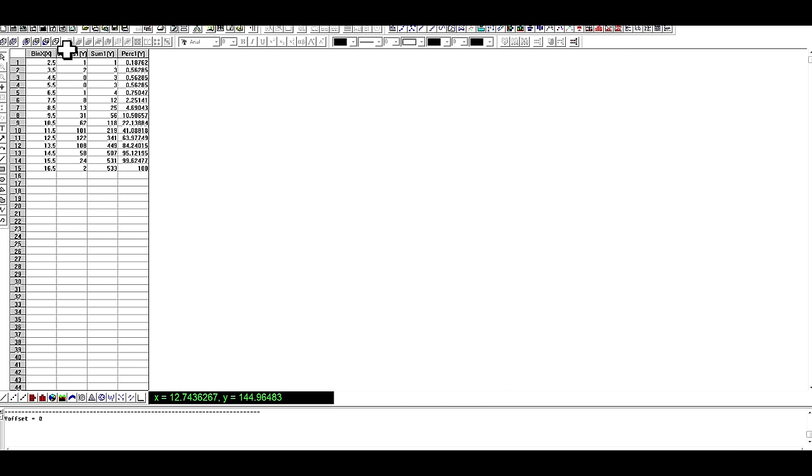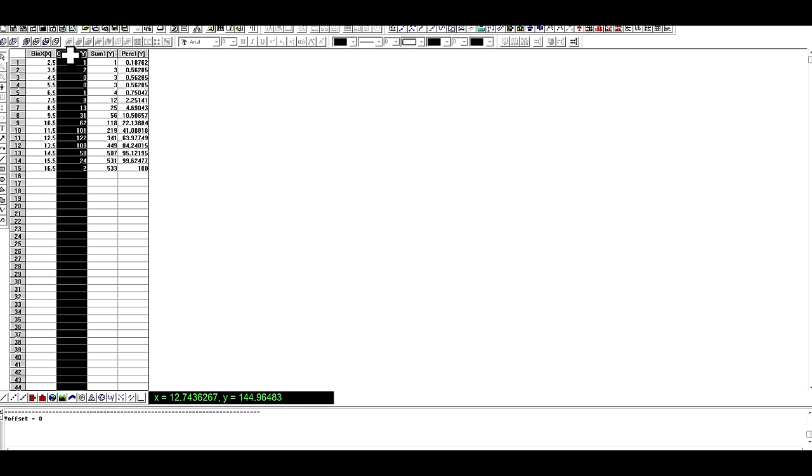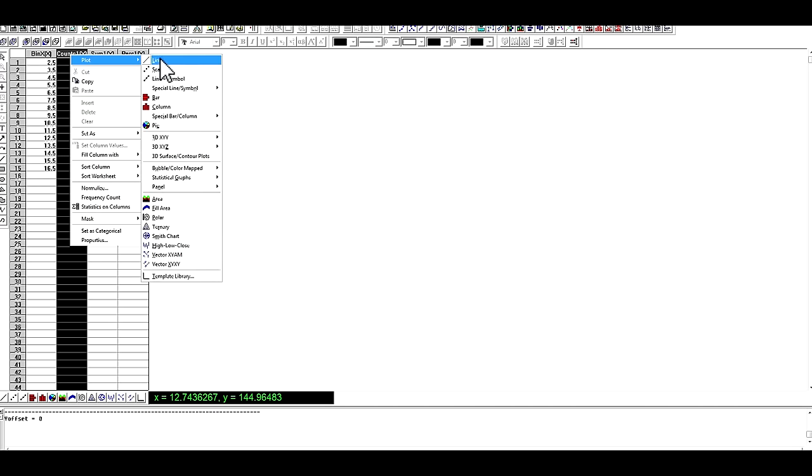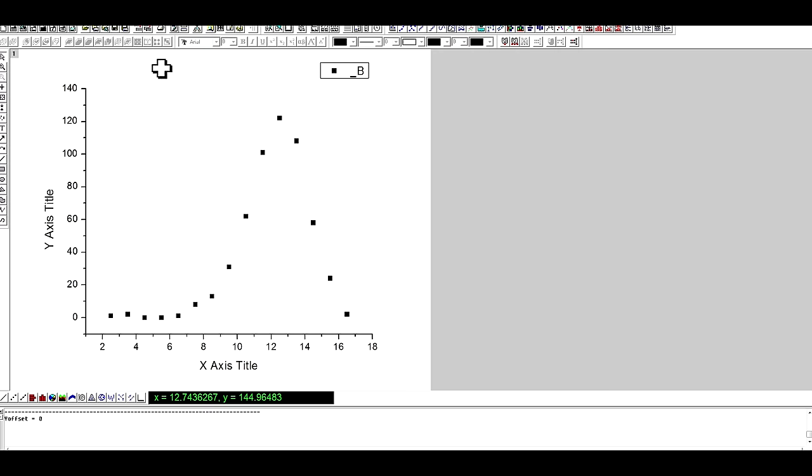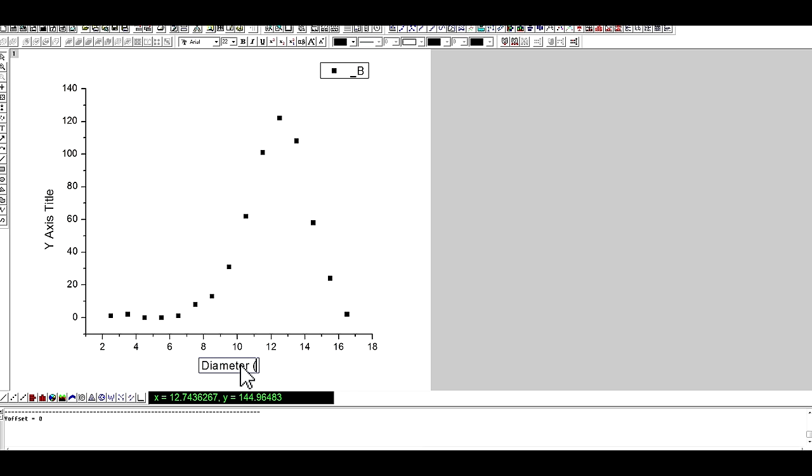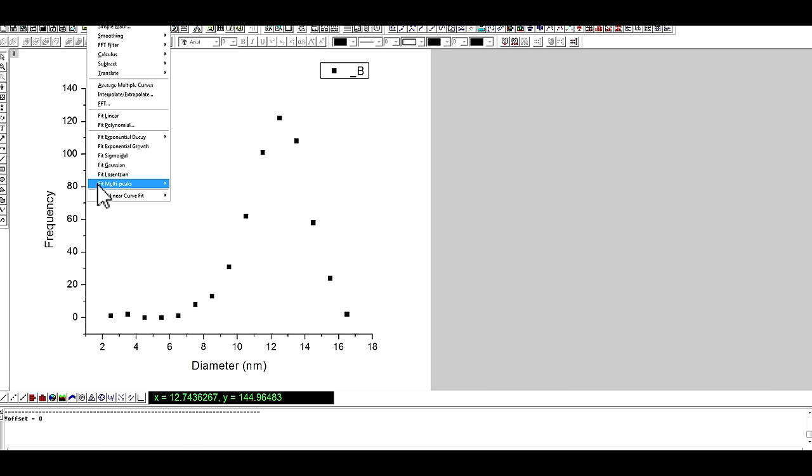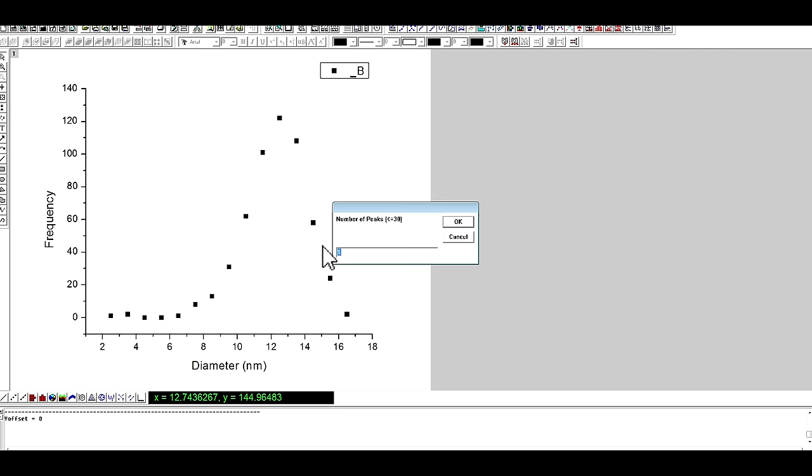Then go to bin worksheet, generate a scatter plot. X-axis is diameter, y-axis is frequency. Then fit Gaussian.